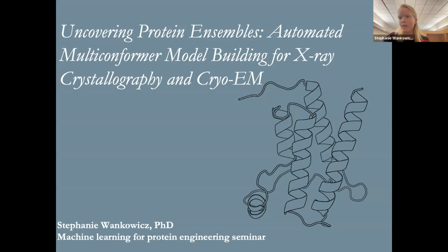That's what I'm going to focus on today, and how we can then use the information that we get from dynamic ensembles of structures to interpret function or apply it prospectively to ligand and protein design. I hope, by the end of today, to convince you that the next breakthrough in protein engineering and any protein design is thinking about a protein from an ensemble point of view. What I mean by that is the many conformations that a protein can have, which often elicit function.